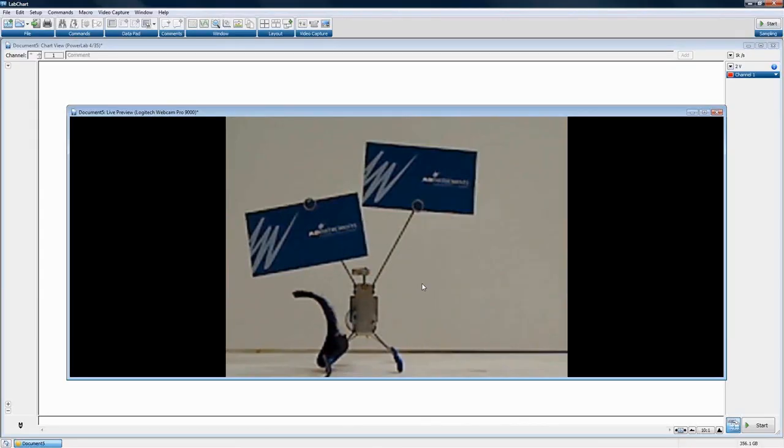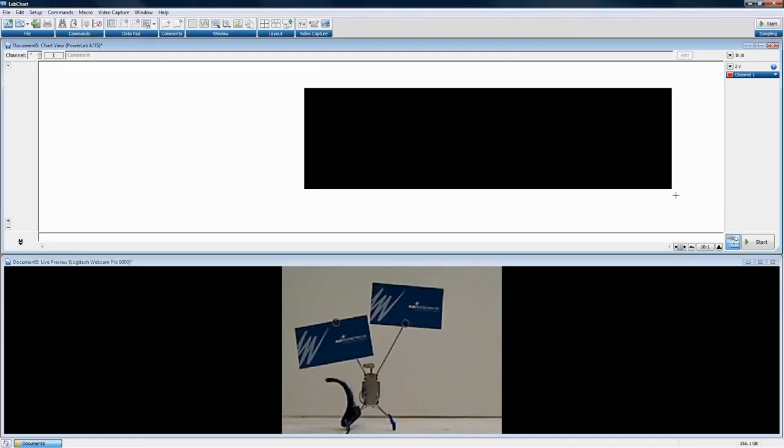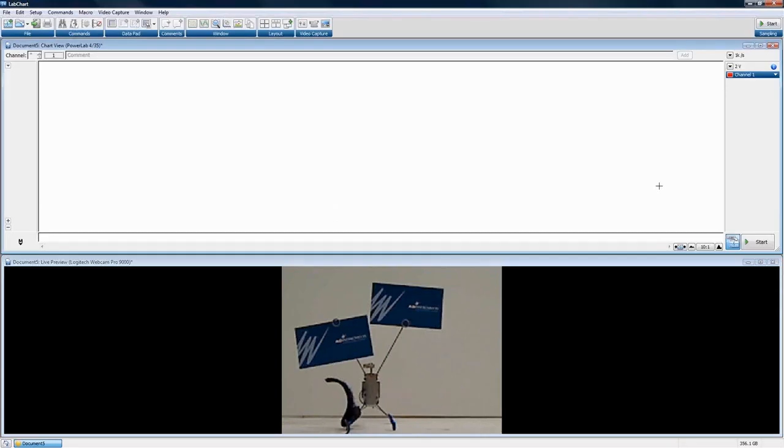So my setup here, I'm going to go ahead and do a smart tile here as well. In channel 1, I actually have a pulse transducer connected here, and that's the output that's going into channel 1. I have my little wind-up child's toy here to give us something that we can see on our video, as well as give us some vibrations on that pulse transducer, so it will actually be recorded here in this file, in channel 1. And right now we're looking at the live preview.